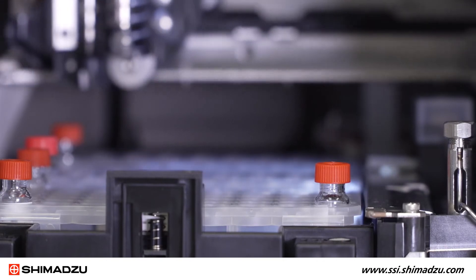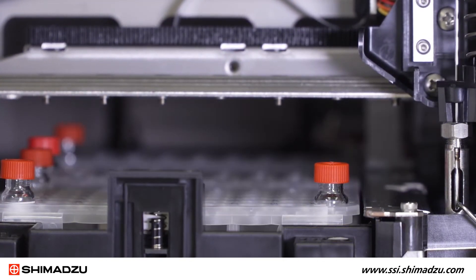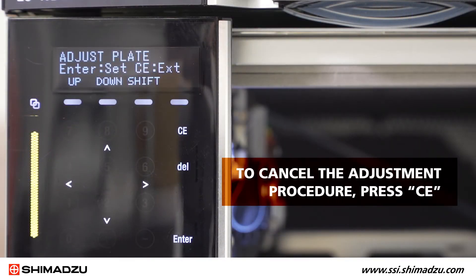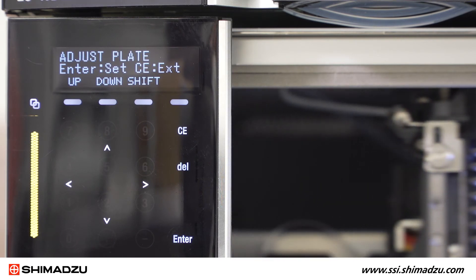Once the adjustment procedure is complete, the needle moves back to the injection port. If at any time you need to cancel the adjustment procedure, press CE. Adjustment data will not be updated.